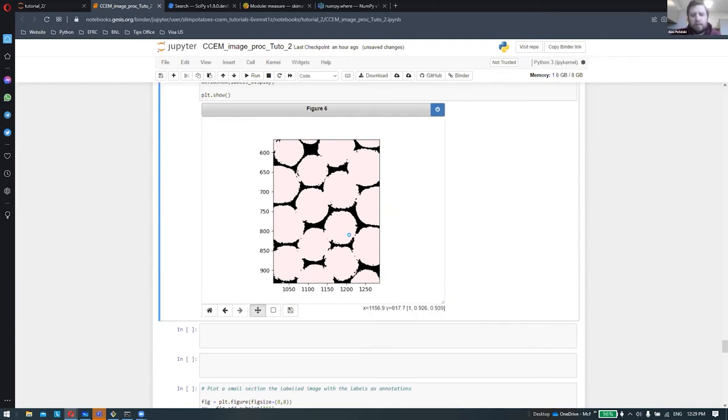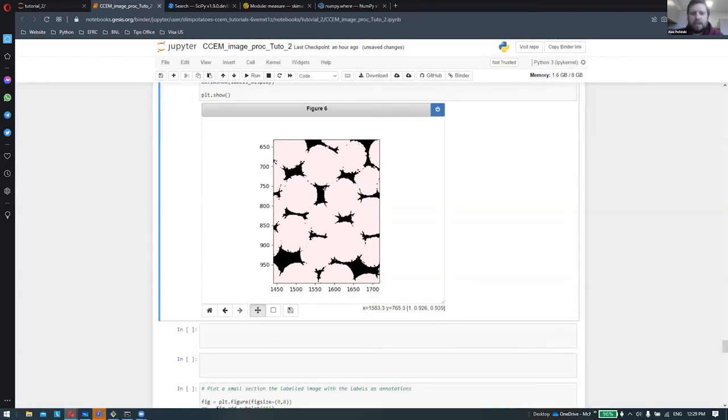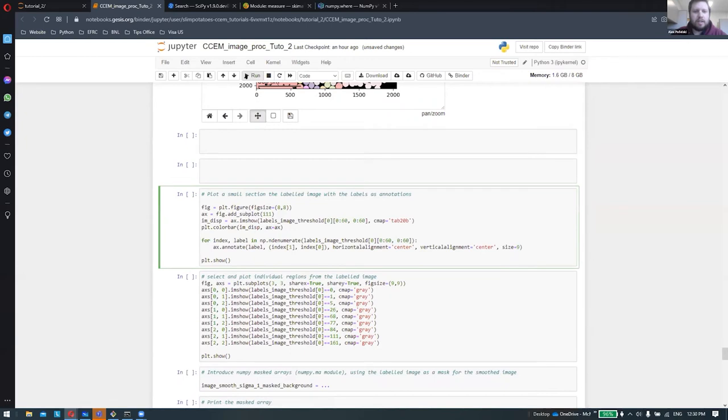So, if you go even more on the overlapped region, this is even worse, because the elements are even overlapped with each other. So this is what we got. Using our simple system, we have a certain set that are well separated, some others are not. But that doesn't mean that it's not usable. We can at least use all the other data to look at what is inside and exclude those ones for the moment, and then we will think about maybe another method to deal with those on the right.